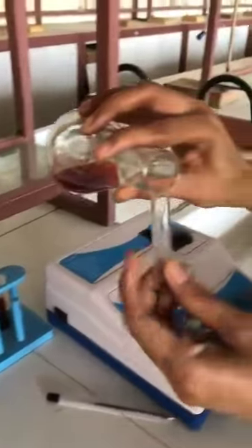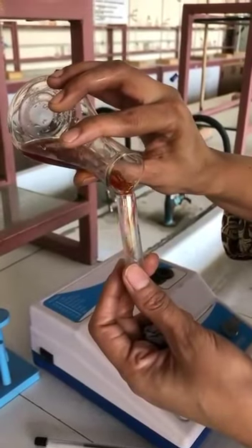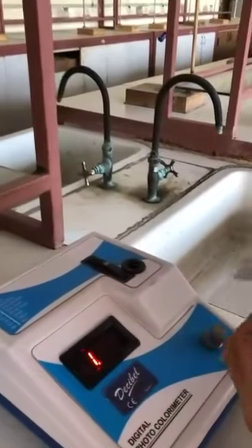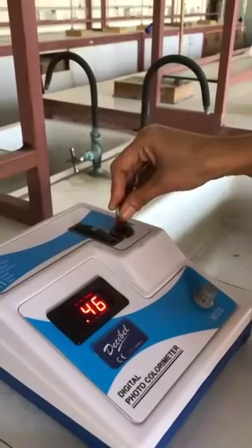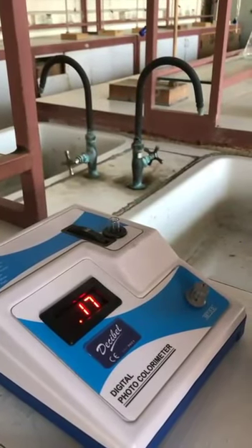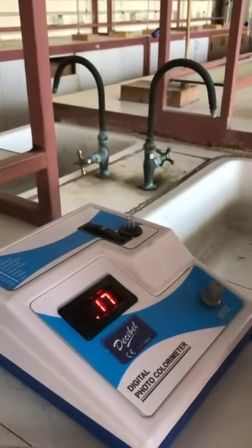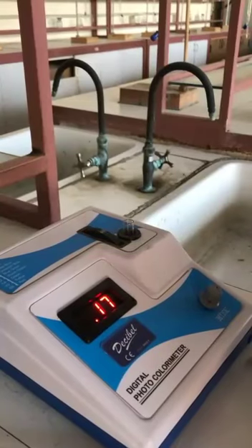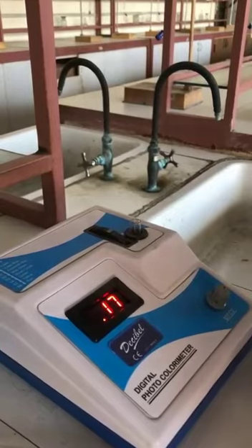For this, we have to again fill this cuvette 3/4, dry with filter paper, insert in the colorimeter and record this reading. With the help of this reading, we have to calculate the unknown concentration with this known absorbance value.